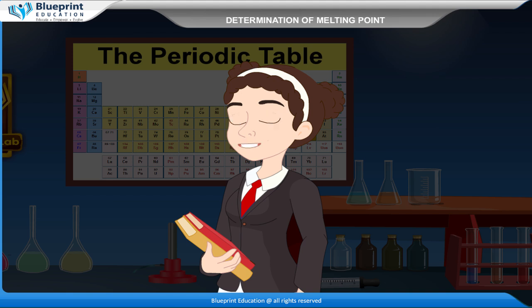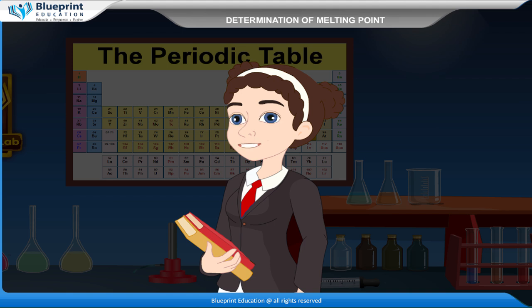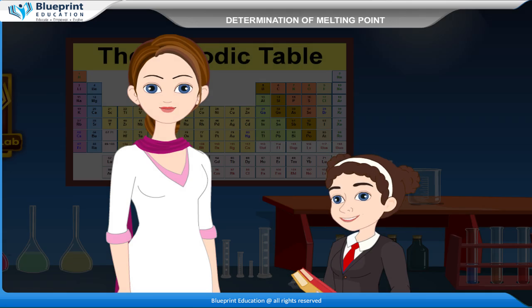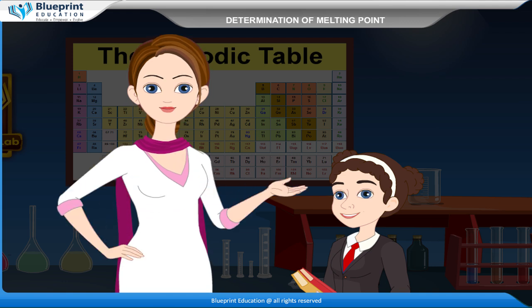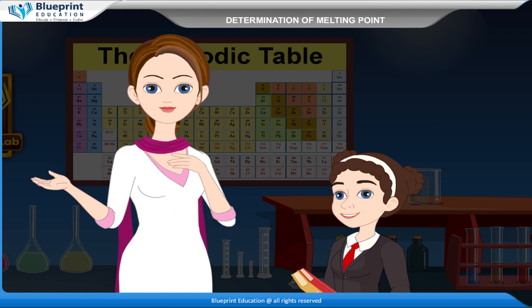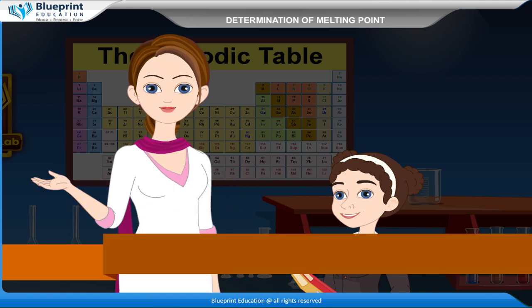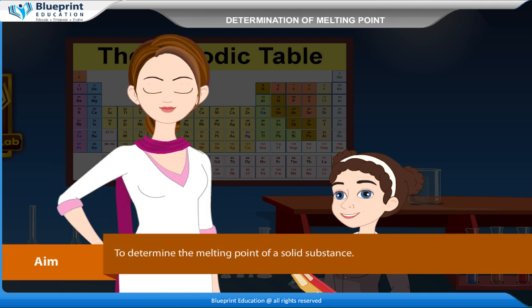How can we determine the melting point? Let us do an experiment to determine the melting point so that you can understand it easily. Aim: to determine the melting point of a solid substance.